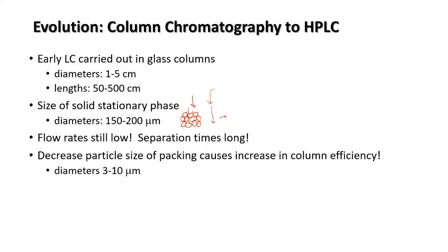So that's why in general column chromatography, the main flaw is that the efficiency of separation is not that much. If you have compounds of very close Rf value, then the separation will not be easily done in regular column chromatographic technique.